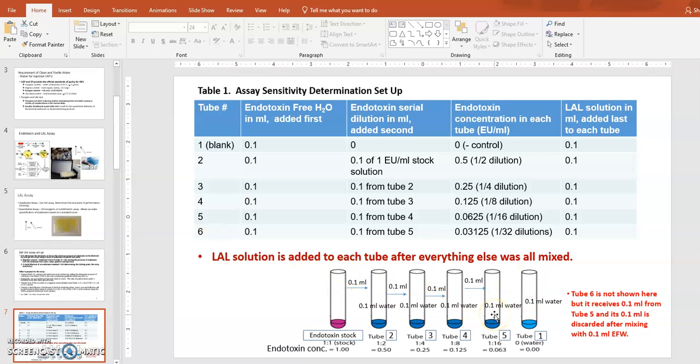So you'll have to work in the biosafety hood aseptically. So put on your gloves, clean up your biosafety hood, and put on your sleeve. Don't expose your naked skin. You have to cover your hands, and your bare skin should not be exposed, by putting on the sleeve, and then your hands and arms should all be sprayed.